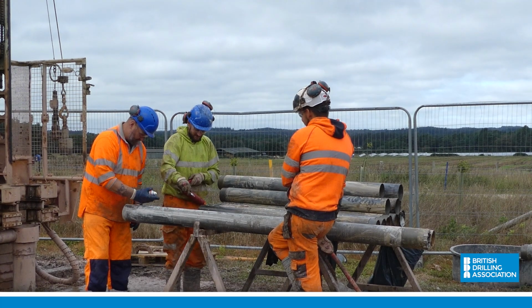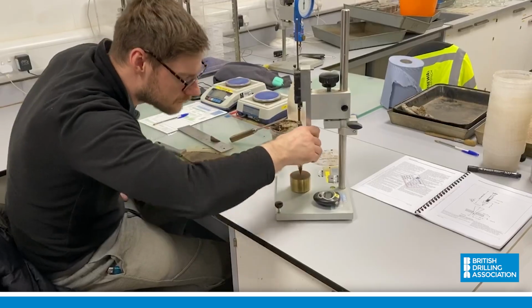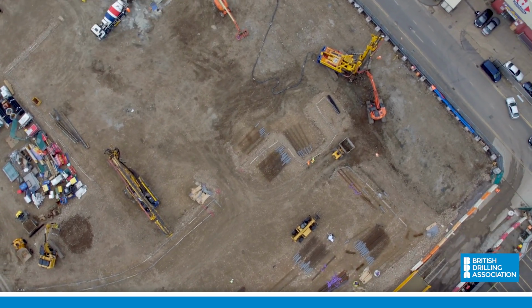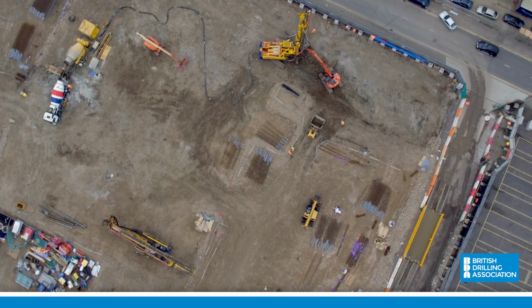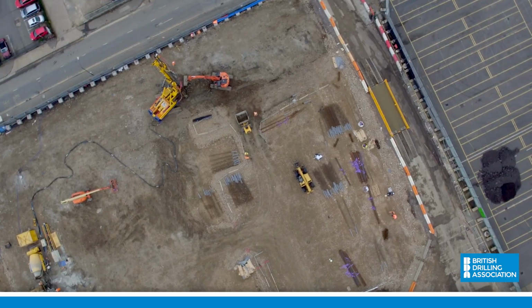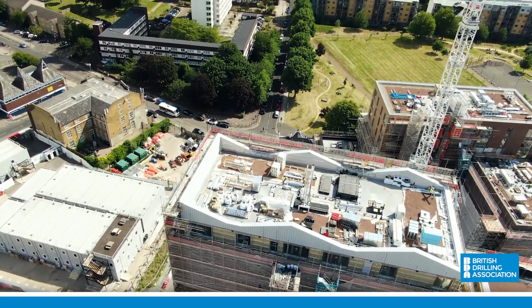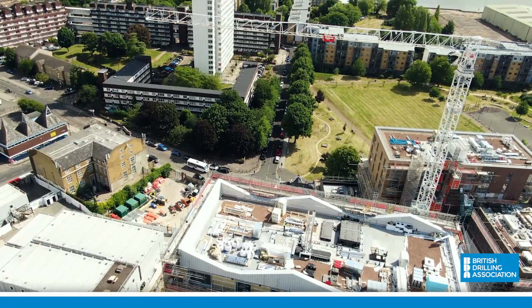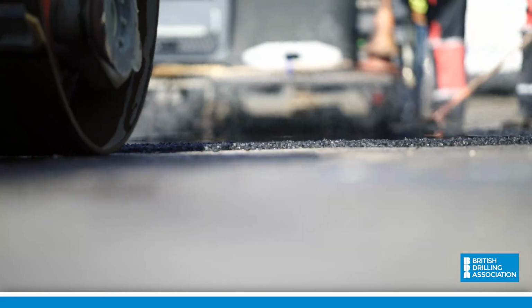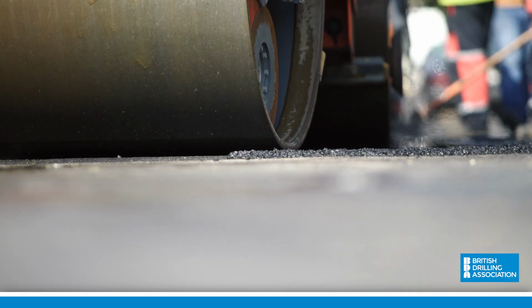From field to laboratory, every step of a sample's journey is essential. It ensures that designers have relevant information relating to the engineering composition of the materials that form the subsurface geological sequence, commonly referred to as the ground model. Essentially, assisting in bringing clarity to a complex system, and therefore allowing structures to be built safely, effectively, and economically, as well as the assessment of land quality and any required remediation.